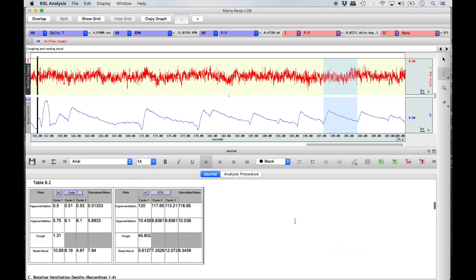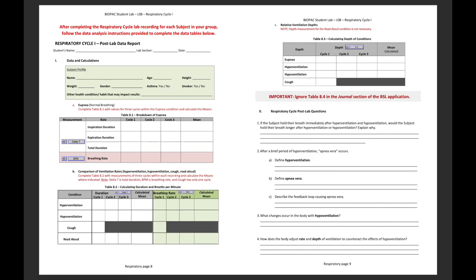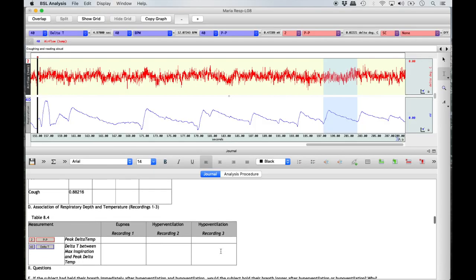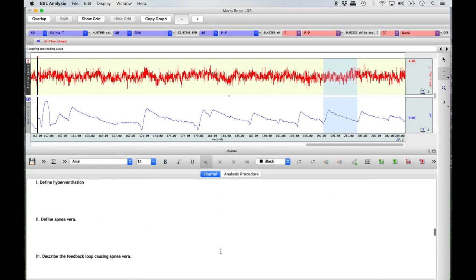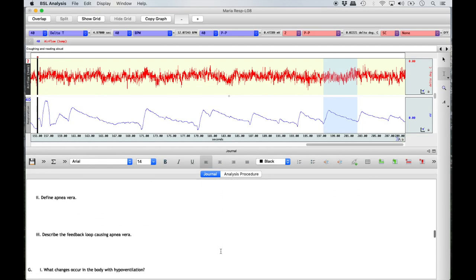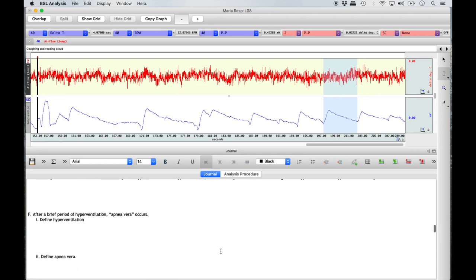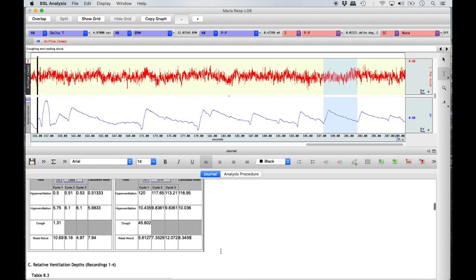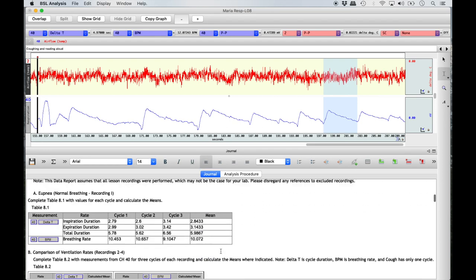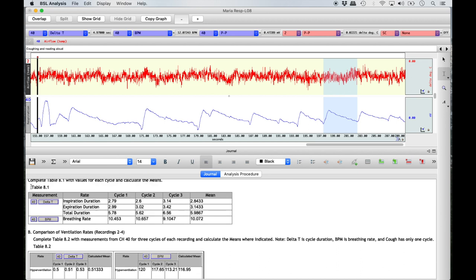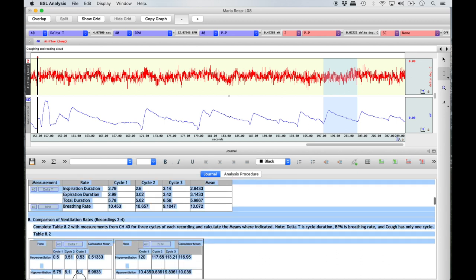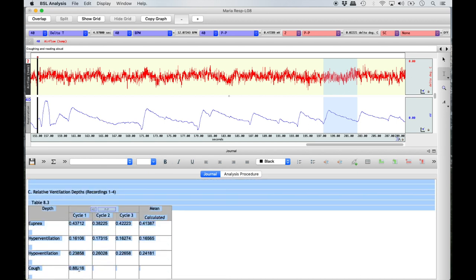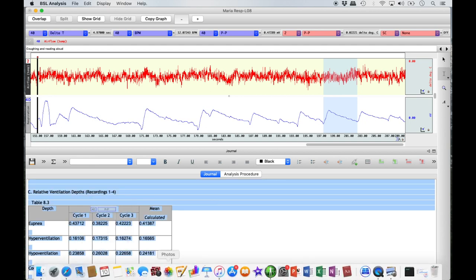Once all the data tables are complete, you can transfer all remaining values by hand to the respiratory cycle post-lab data tables in your must-know book. Do not answer the electronic version of the post-lab questions in the BSL application, as these questions have been modified. If your instructor wants copies of your data tables for a lab report, you can highlight the data tables in the journal section and then copy and paste them into either a Word or Excel document.